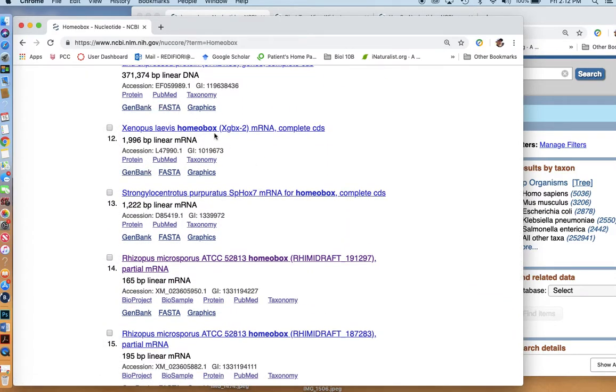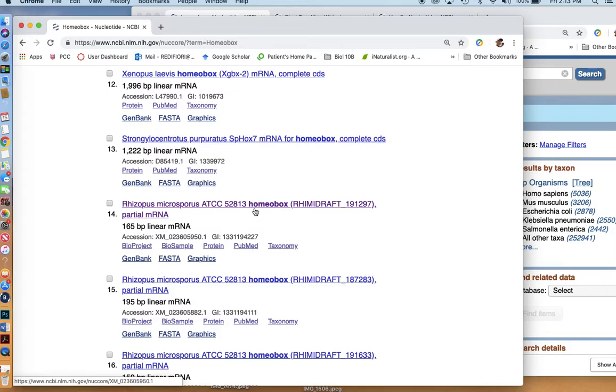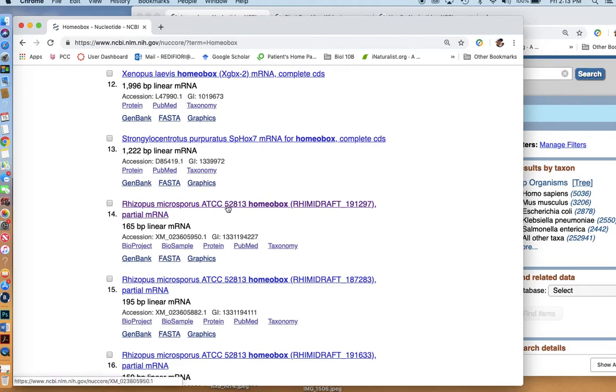Here's a frog. It's, once again, still a chordate. Here's something interesting, though. Rhizopus microsporus is a fungus. And to find this gene in a fungus, which is not within the kingdom animalia at all, might be interesting. It's a nice short base pair piece, so let's try that one.